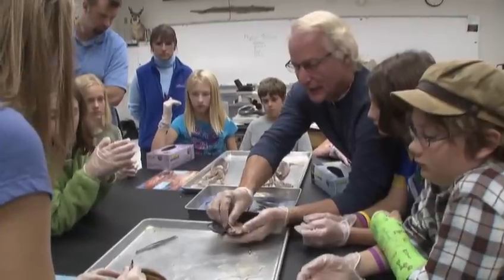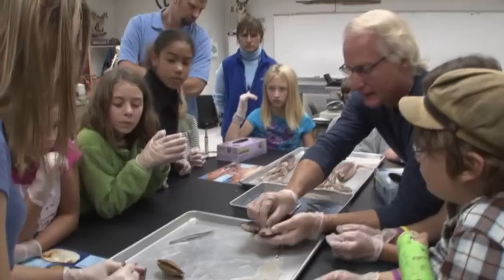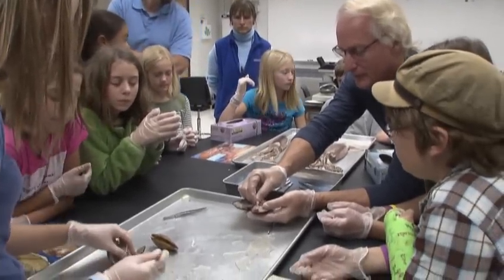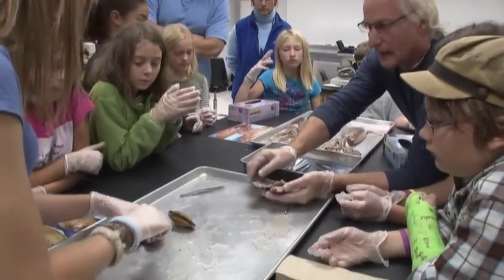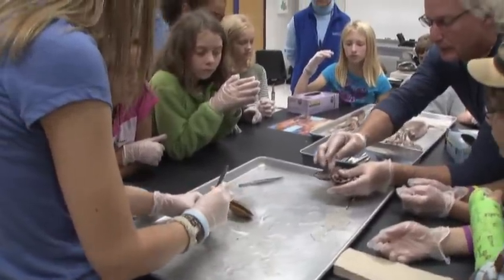So, Courtney, you took your mantle off there, right? I did. And we have the gills. There's two sets on each side. They're kind of a fold here, see them? Where should I cut on this here? You can cut right down the middle, like right here. You can hold this up. This is the foot. See this part?